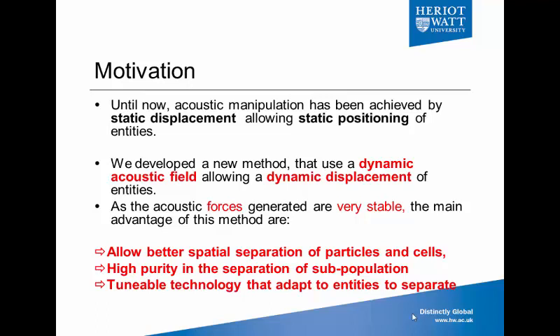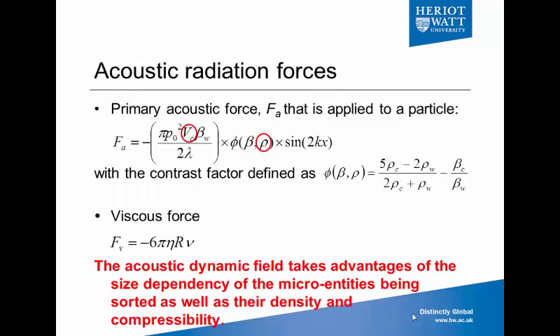So the motivation is to develop an acoustic sorting device that is tunable and that also allows better spatial resolution for particle sorting and also gets high purity in the separation of the subpopulation. So the idea is to develop a dynamic acoustic field that allows us to take the advantages of the primary acoustic radiation force and the viscosity or the drag force.